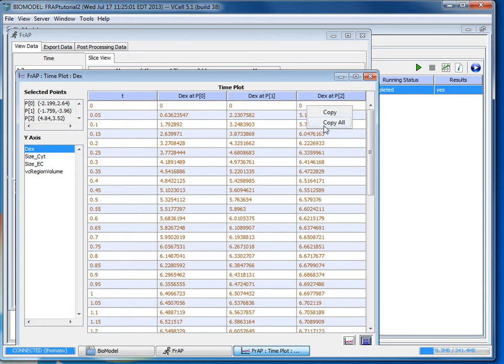If you want you can also view it as a spreadsheet which you could then right click and select copy certain values or copy all the values and paste them into Microsoft Excel and save it as a document. And that has been the simple FRAP tutorial.